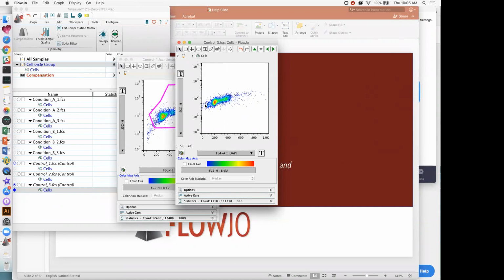Now, as I mentioned, you may want to create a gate around the euploid cells because the algorithm that we have doesn't incorporate the polyploid cells. In other words, you cannot model the polyploid cells. You can quantify how many of those there are, and so if I were you, a lot of times I like to leave the cells kind of untouched here, and I don't go ahead and gate them with a euploid gate. I leave them alone.